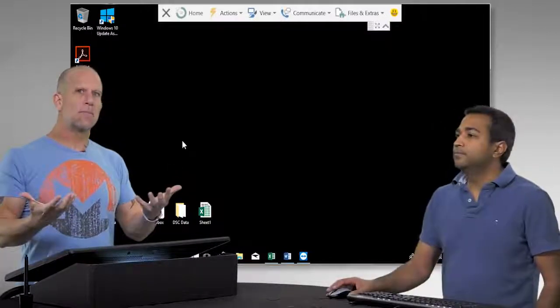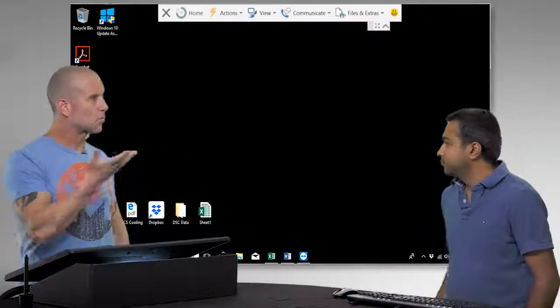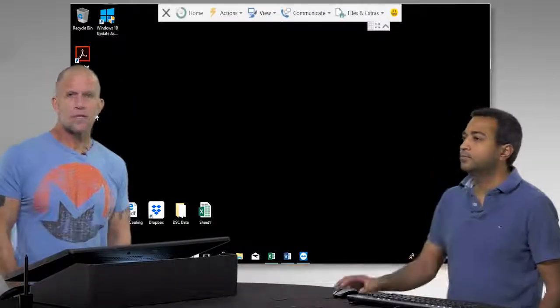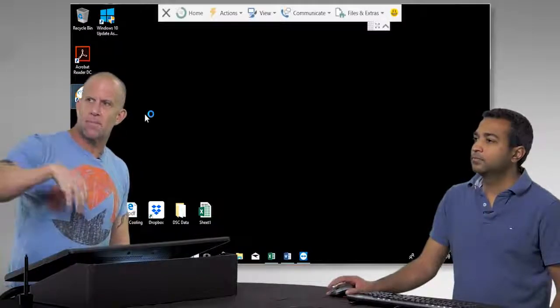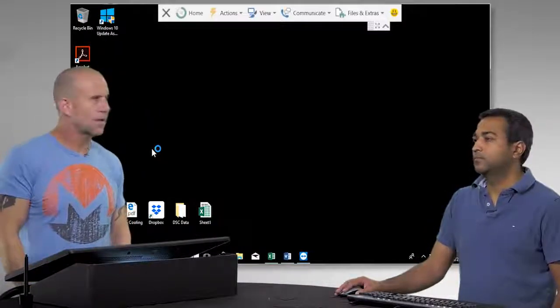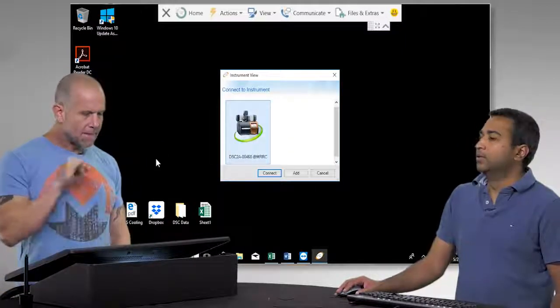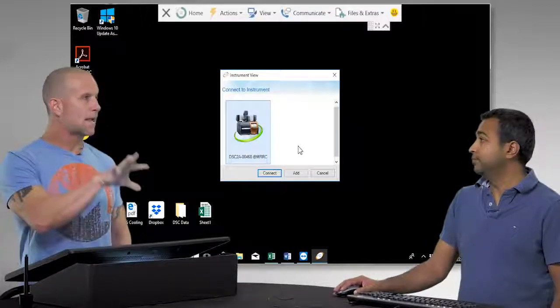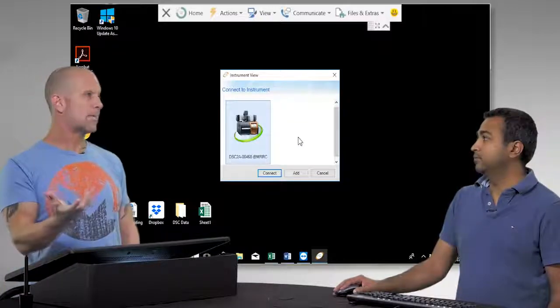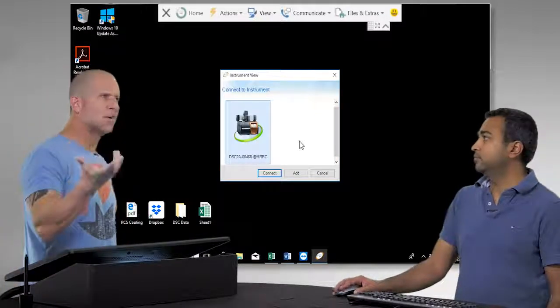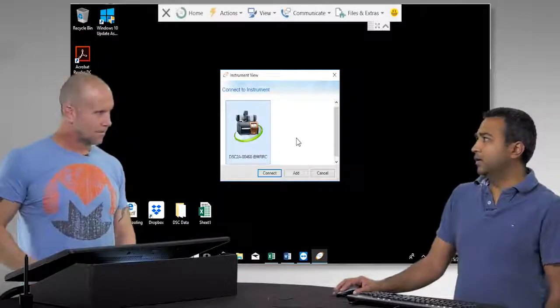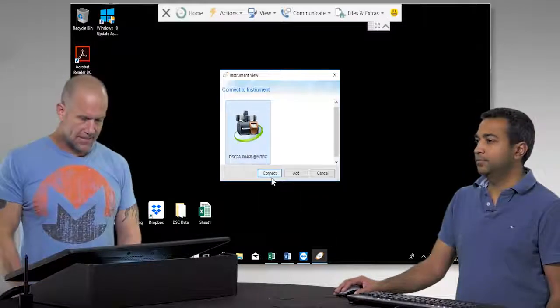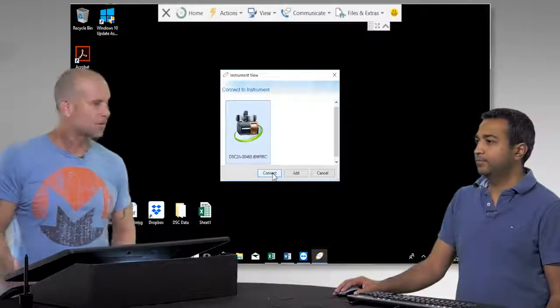Most of the time when people are running Trios after they collect data, it's just for analysis. We're going to use it today for collecting data. If we start running Trios on the computer, we have a shortcut on the desktop. The nice thing is that if you had multiple instruments, they would all show up here. The same software can run any of the thermodynamic suite of calorimeters or even their mechanical testers. We only have one instrument hooked up — the DSC 2500 — and it even shows a picture of what it looks like.